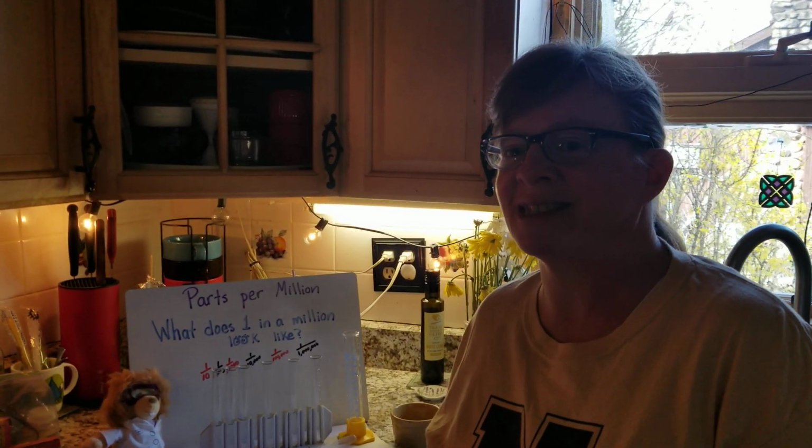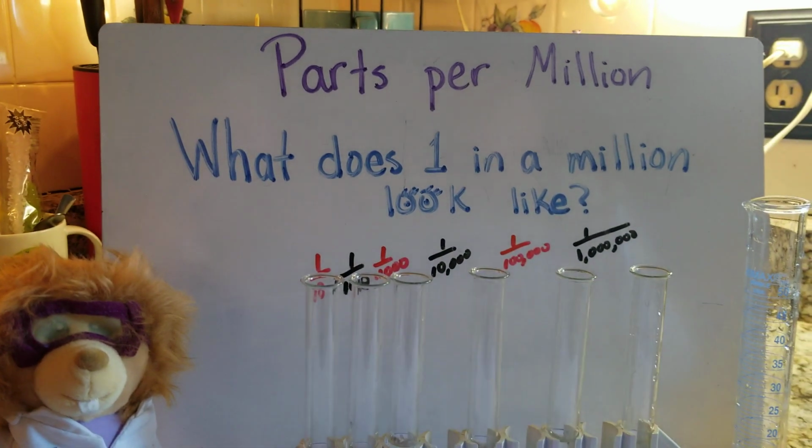Okay, today we're going to take a look at something related to solutions called parts per million. Basically, what does 1 in a million look like?